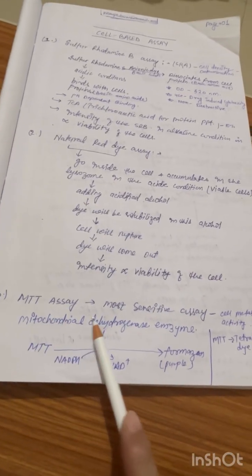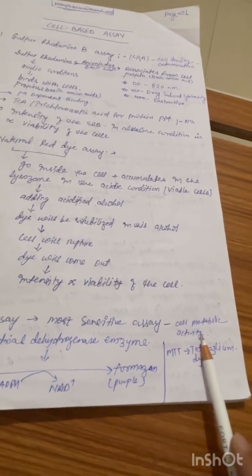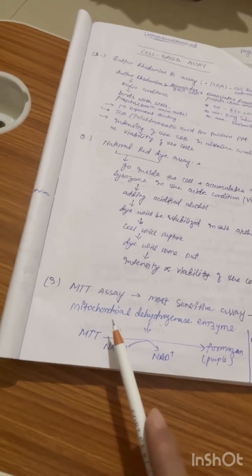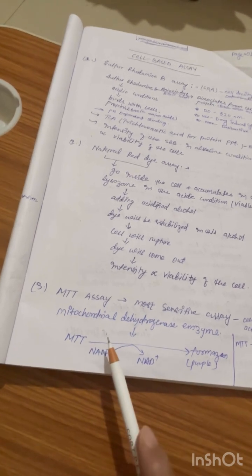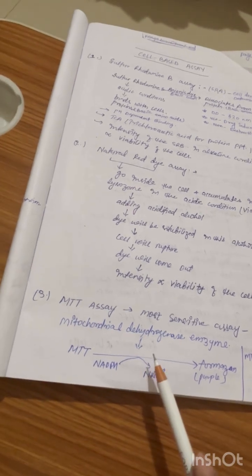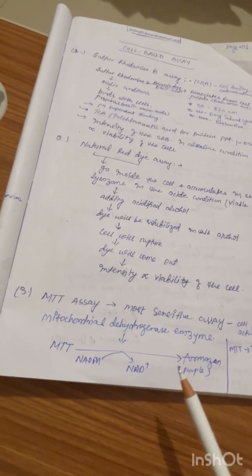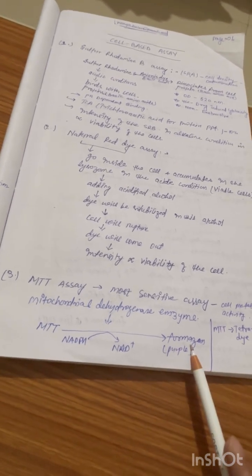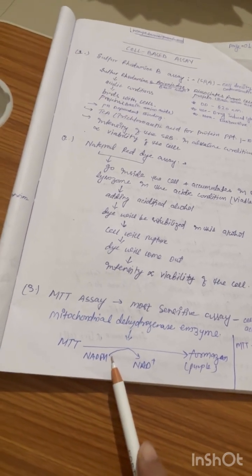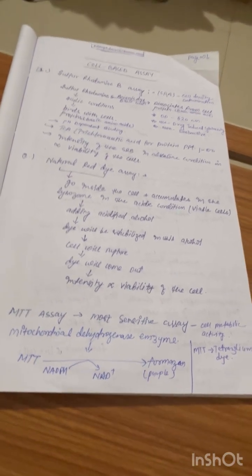Next, the MTT assay, which is a most sensitive assay. It is used for the determination of the metabolic activity of the cells. In this assay, what will happen when we add this MTT? MTT is nothing but a tetrazolium dye. It will go inside the cell, and it will be converted into formazan in the presence of NADPH. This NADPH simply reduces this MTT into formazan, which is purple in color.